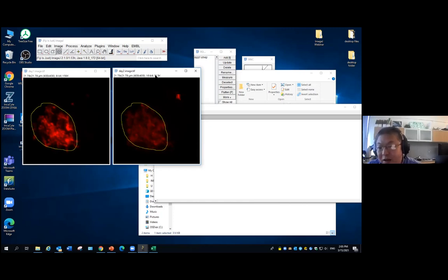When we're talking about image analysis, most people think we get the digital image, we have all the images in files, in TIFF or any format, and we begin to analyze them. But you need to make sure the analysis actually starts with how you take the image. You need to take the best image you can get for the analysis.